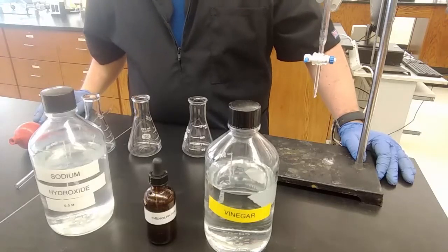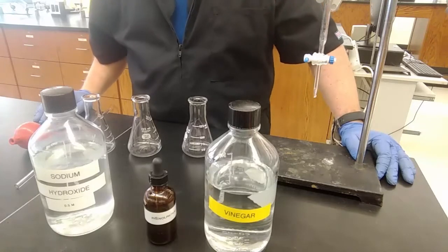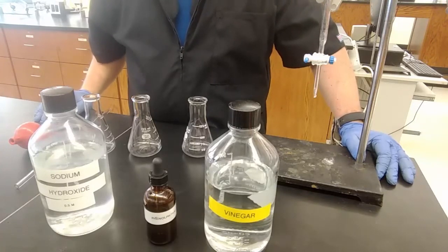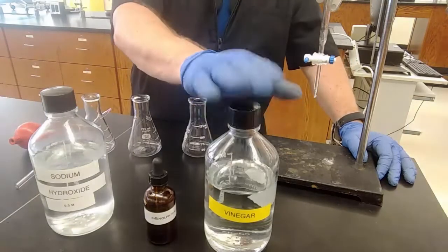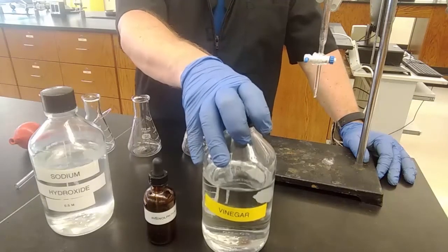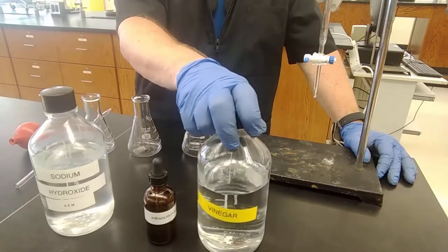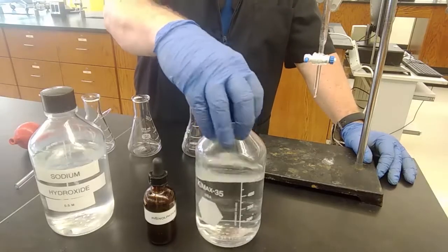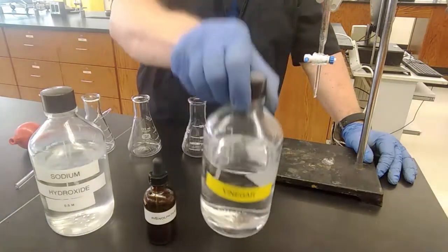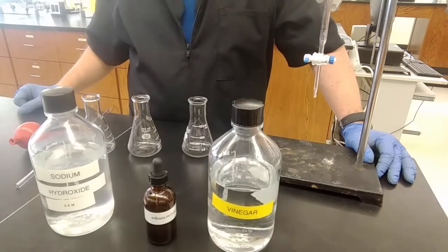Experiment 13, determination of solution concentration via titration, works incredibly well. No anomalous, wacky results like the pH lab. This lab works incredibly well, and we're able to determine the percent of acid in a solution of vinegar, which you might have at home in salad dressing and so on and so forth. It's well known that vinegar is 5% by volume acetic acid, and we're going to be able to confirm that in this lab.